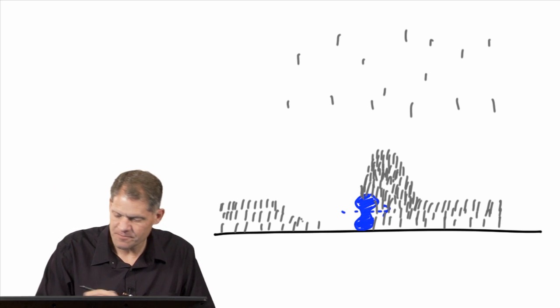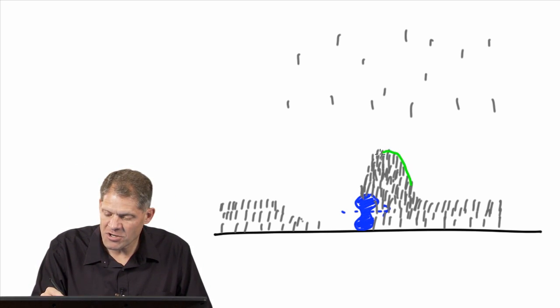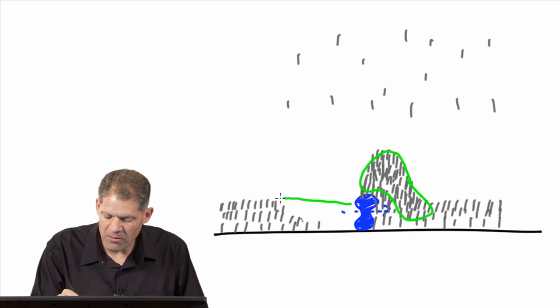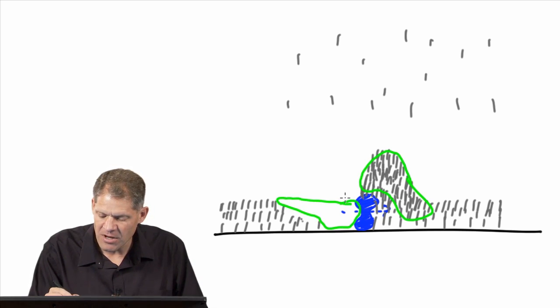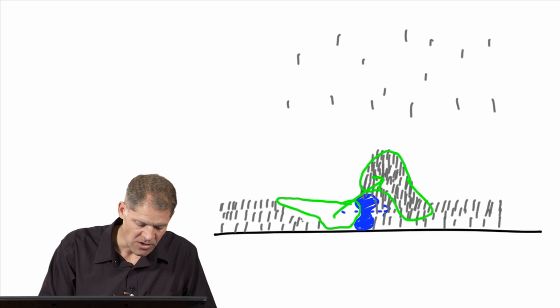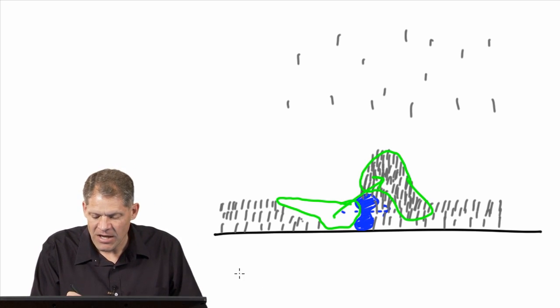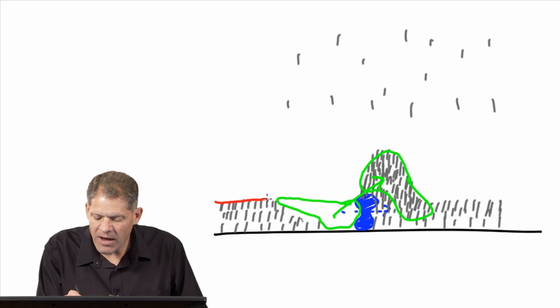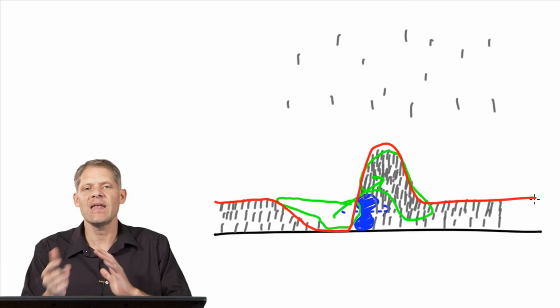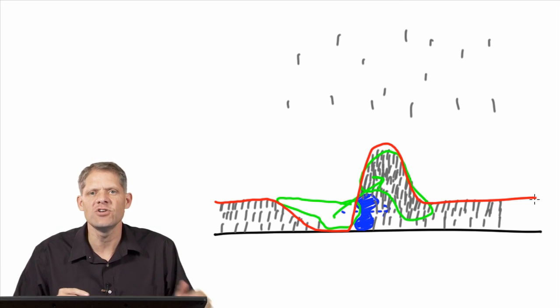And as a result, you have a large amount of extra metal built up on the front side of that object, and it is the metal that would otherwise have fallen in this region, but it was captured on the front side. So this metal moves to there, and as a result, you have a very strong contrast. If you were to plot the density of the metal here, it would be at this level, and then it would drop and go almost to nothing, and then it would be very high here and then back to the baseline. And it's that contrast that you see in shadowing.